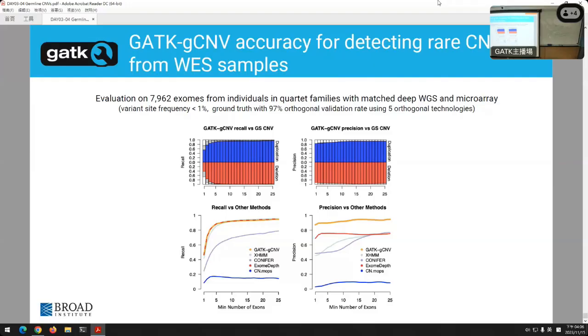You can use the clustering approach that I described later on in the slides to identify well-matched samples, so taking in read count over a set of intervals and then performing PCA and then clustering. That will identify groups of samples that are well-matched. So really the sequencing method and the capture and things like that are what's going to influence how well matched the samples are, rather than family structure.